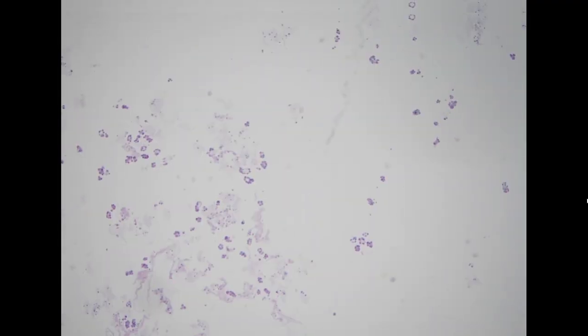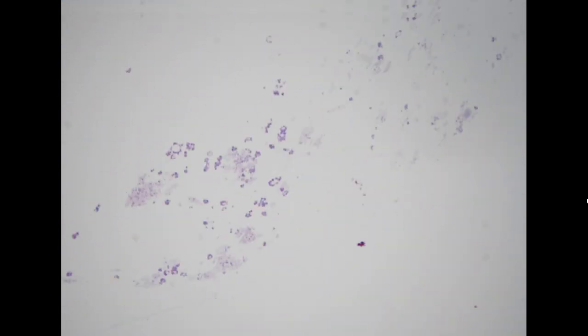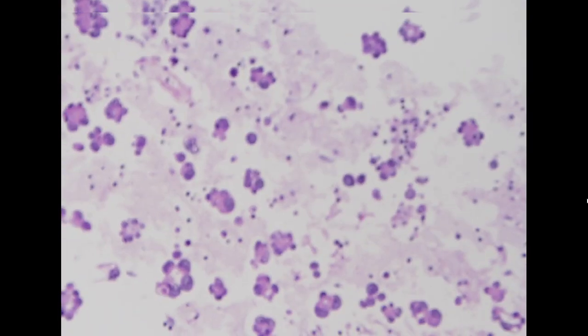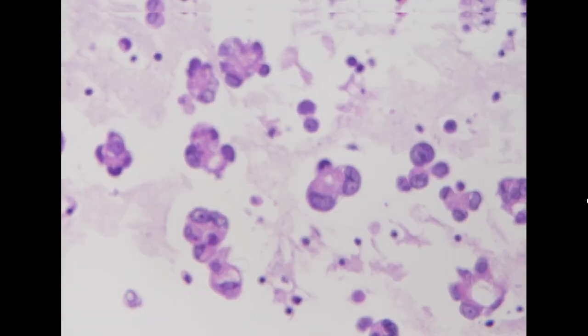So let's take a look at the cell block here. This is our cell block preparation. Again, it has a reverse micropapillary type of pattern, which is very typical for our lung cancer patients.